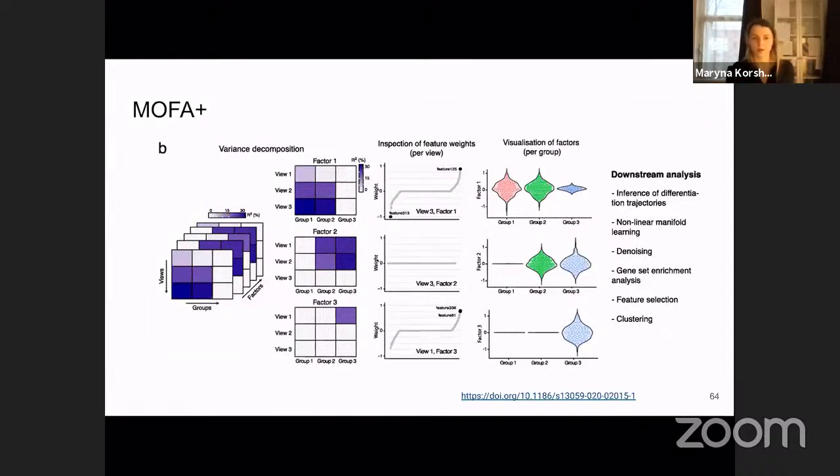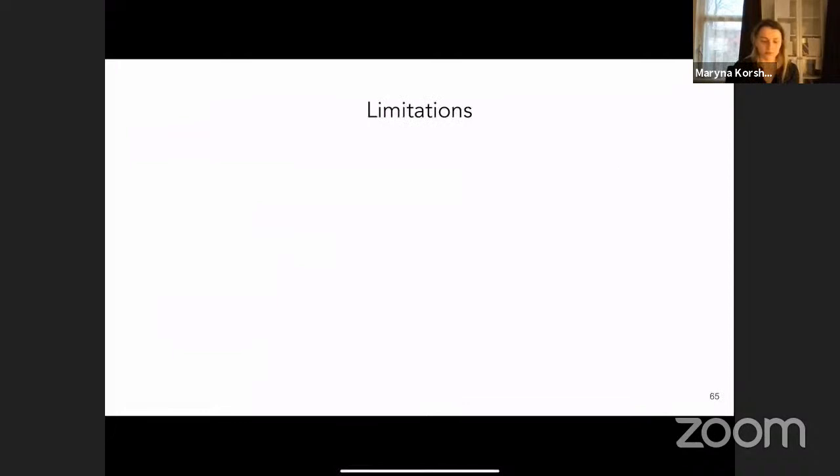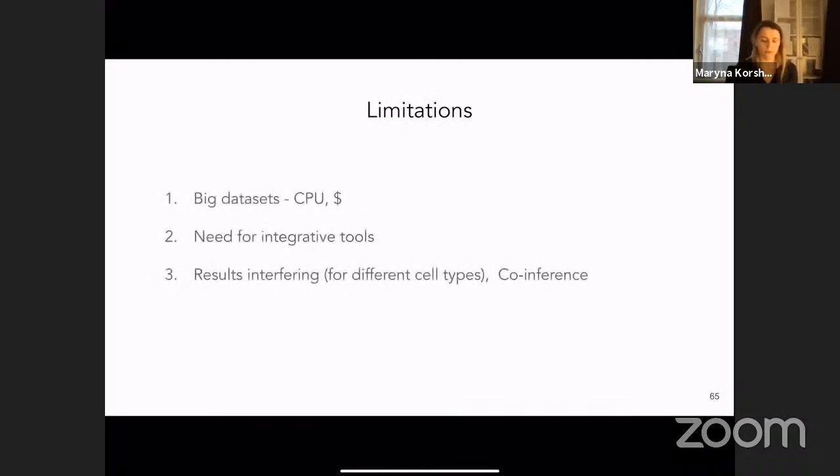So the idea is to highlight which of these factors explain the variability, and which of these different biomarkers could be grouped together.